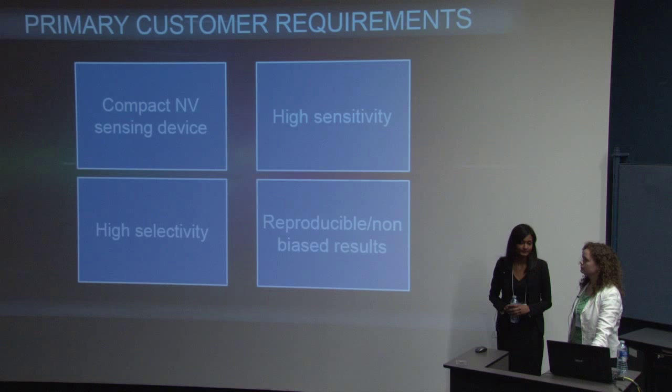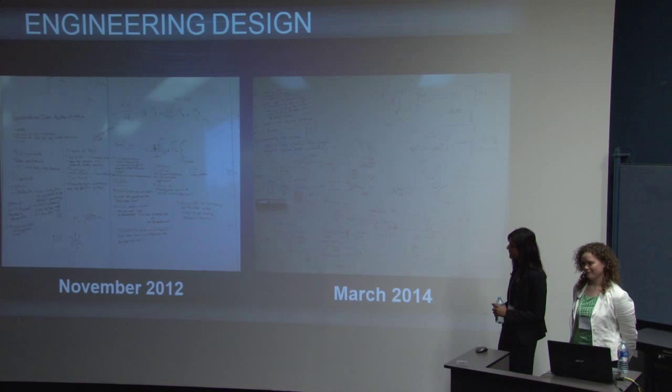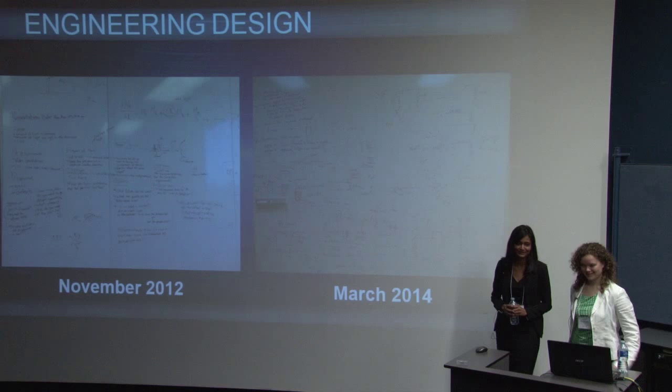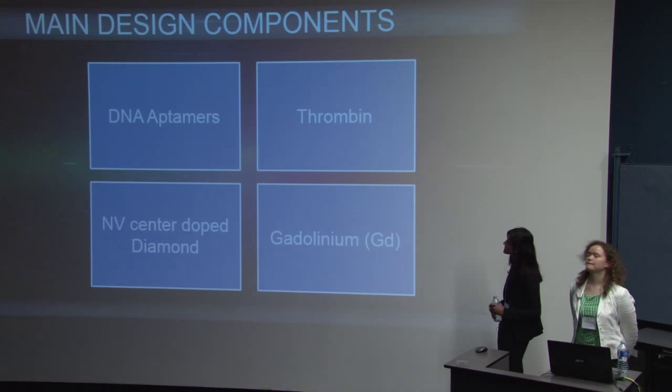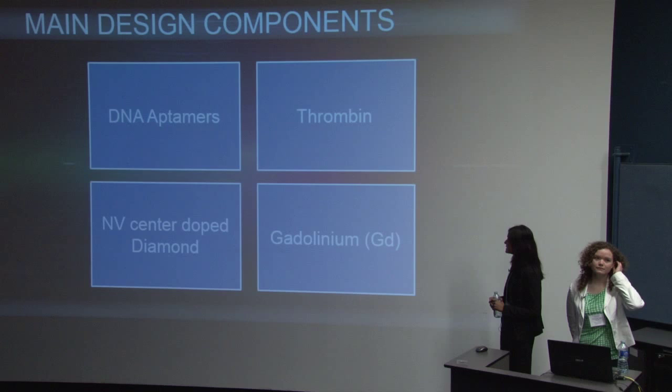From the conception of the design back in November 2012, we had a lot of questions that needed to be answered. Two years down the road, March 2014, we believe we have been able to answer a whole bunch of them. And we're going to take you through the process of how we went through the design and answered these questions. We have four main design components that we have used to build our sensor. Those include DNA aptamers, thrombin, the NV center doped diamond, and the gadolinium.